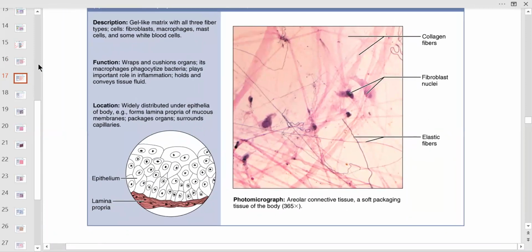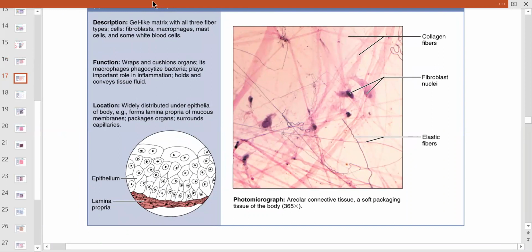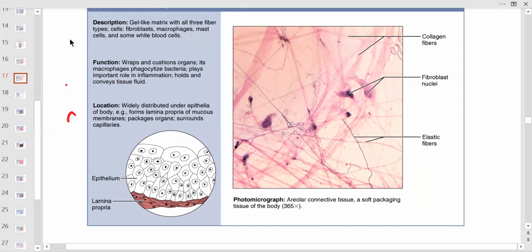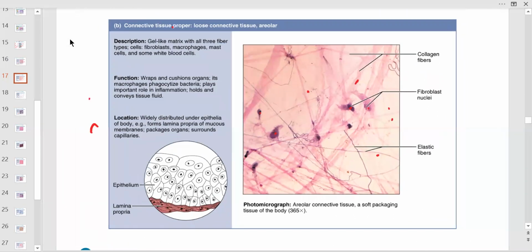So this time I think we should look at the histology first, because the cartoon does not help me here. I've got to look at this. It looks kind of like a weird art thing you'd see. So let's take a look. You have these thick things in here. That's collagen fibers. You could see the nuclei of the cells, and these cells would be fibroblasts because they're producing the collagen, really laying down the ground substance in between, which is all protein. And the thin ones are elastic fibers, and I don't see any reticular fibers in here.